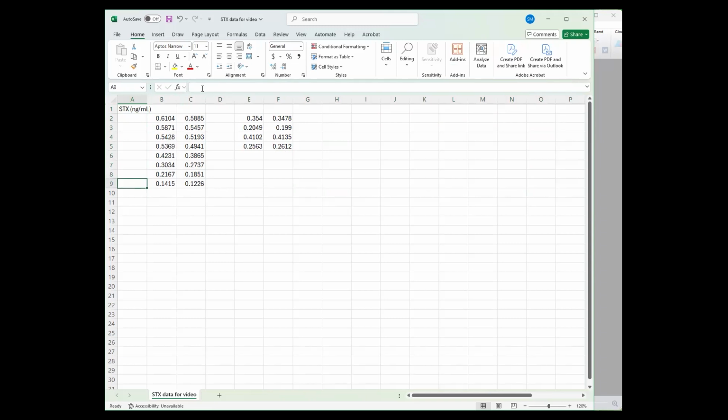And it starts at 2, that's our highest concentration, and each subsequent dilution is half of the other. So we can use Excel to calculate what our standard curve is, with 0 being the highest OD. Then we have a series of unknown samples here, and I'm just going to drag them down there.